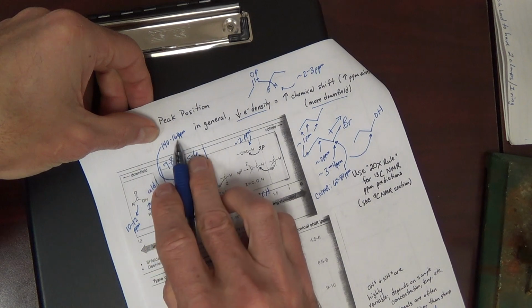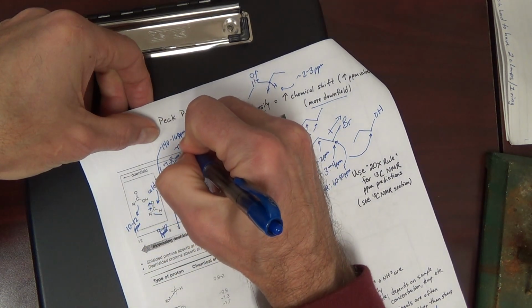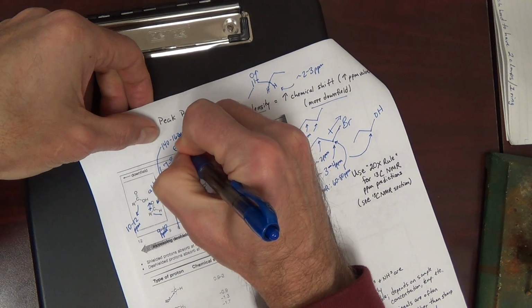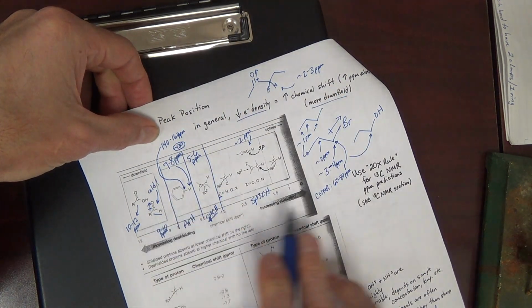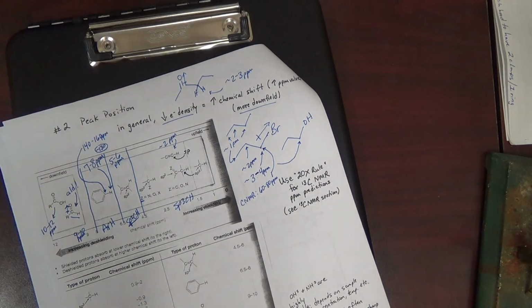Again, it gets you in the ballpark. Actually, for benzene, it's about 130. So it's not quite 20, it's more like 18 or 19, but 20 is a little bit easier to remember.